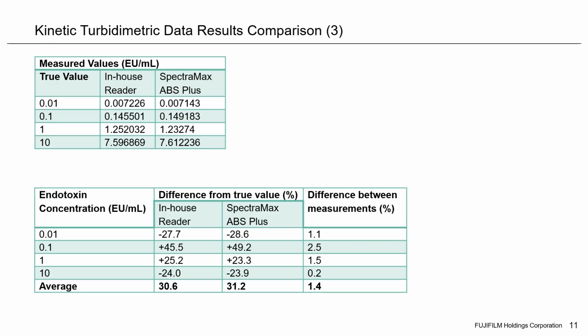That's just the fact that we have a linear regression calculation taking place here. In that line, the data has a slight curve to it, and that line is approximating the regression for that. This is perfectly normal. Once again, we're seeing values well within the 50 to 200% range. That is the overall accuracy, or I should say resolution of the assay.